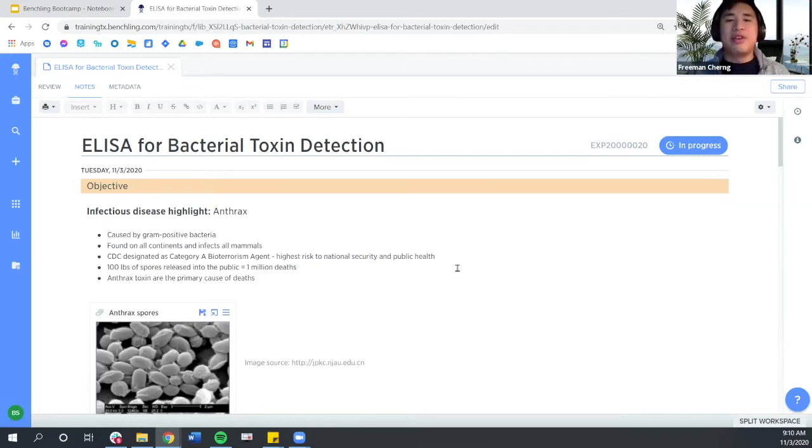Great. So now to walk through how we navigate through the Benchling platform, I'd like to point out this navigation bar here on the left, which constitutes some major applications in Benchling. So I'll walk through a few of these key icons. First, we have this jellyfish logo, or Jeffy P, our Benchling mascot. This will be your home button.